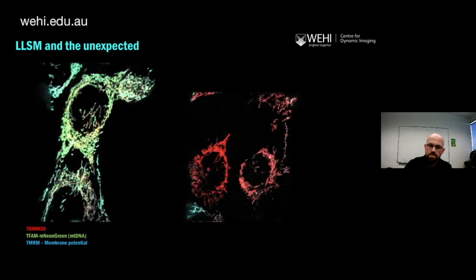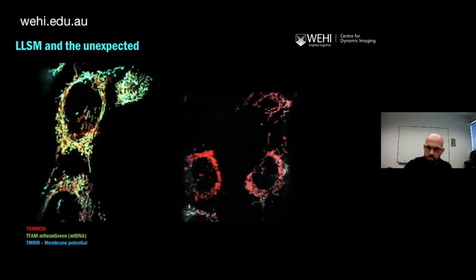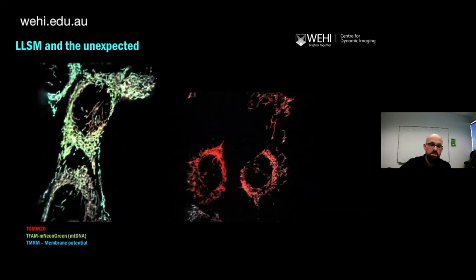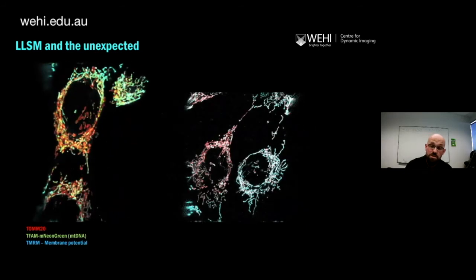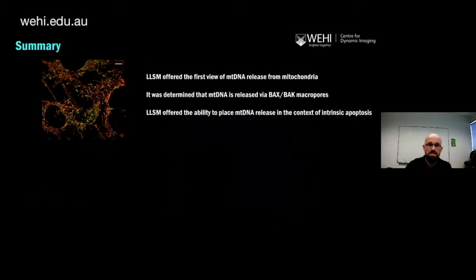Also here, you see a cell in the bottom right corner, the potential disappears, but also downstream of this, just before the cell fragments, it comes back on in a punctate way and then disappears. Again, not sure what this means, but I thought it would be nice to throw out there, because someone out there, especially this particular audience, might say, oh, wow, that's this, or that might just be nothing. But to summarize this point, the technology really allowed Kate and Lockie and Kelly and Ben to visualize this process in exquisite detail, and it had never been done before.